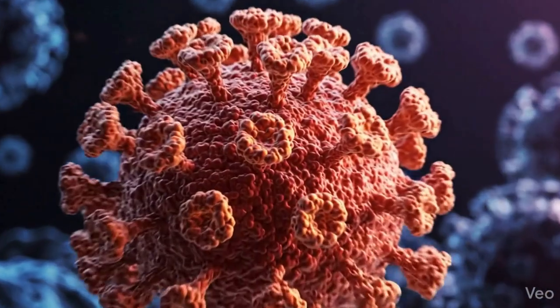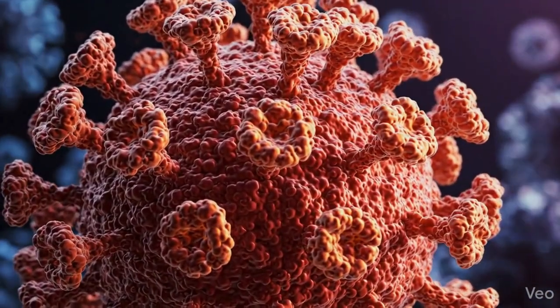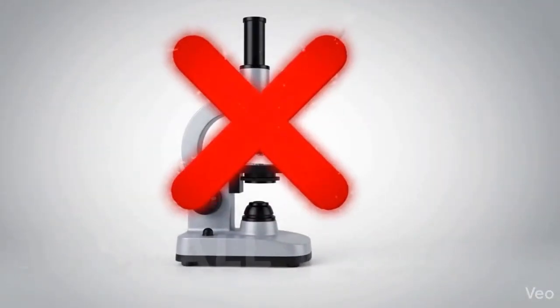Have you ever wondered how scientists design life-saving drugs? It all comes down to one fundamental rule. Molecular structure defines biological function. To stop a virus, you must see its proteins. But there's a massive problem. They are too small for normal microscopes.